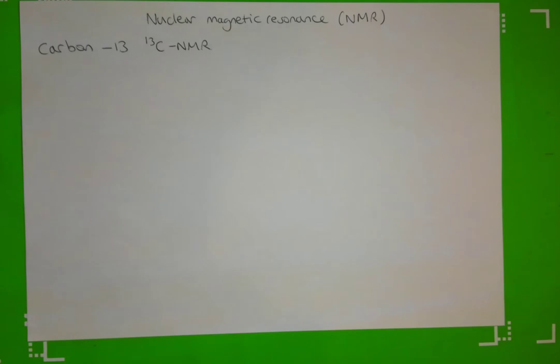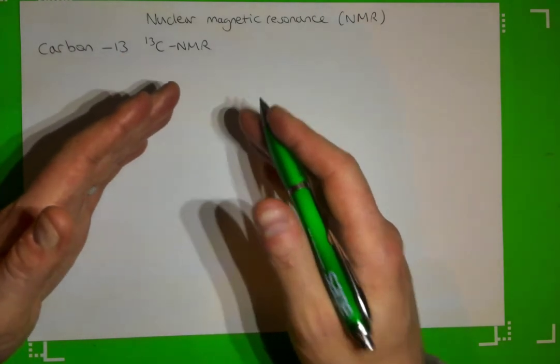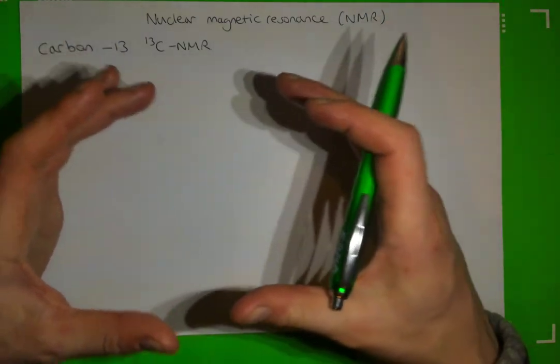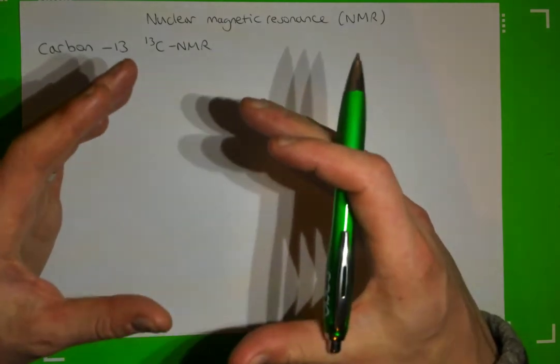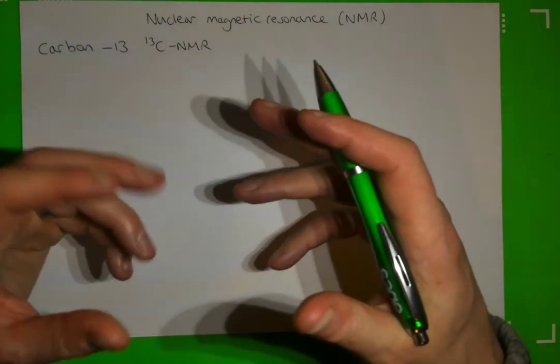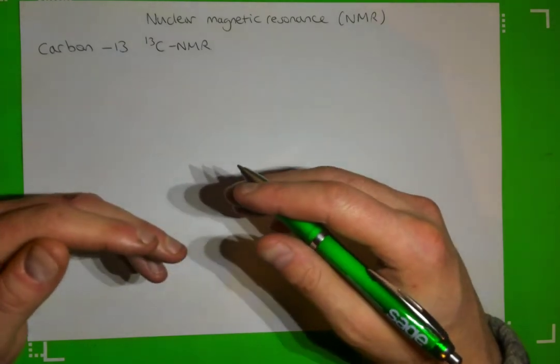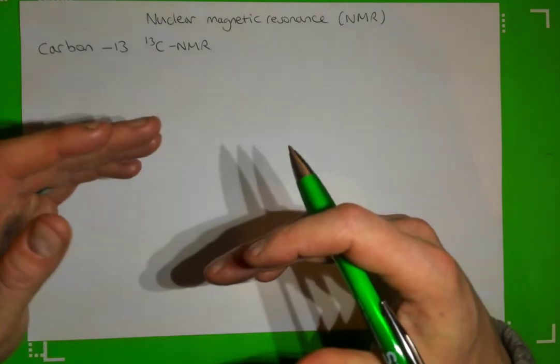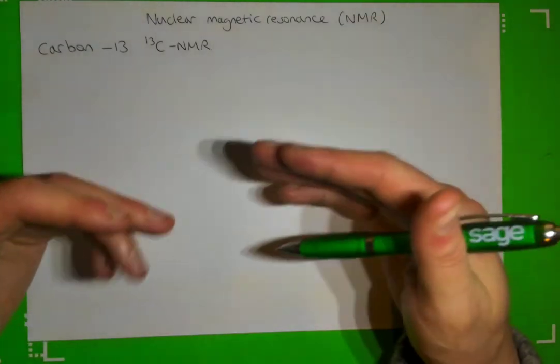But essentially, it's where we take a sample or molecule and we apply a magnetic field to it, and it's surrounded by a source of radio waves with a radio receiver, and this generates an energy change in the nuclei of the atoms, and it's that energy change in the nuclei of the atoms which determines the structure of the molecule, because depending on the environment of the atoms within the molecule, their frequency changes by a certain amount. We'll call that the chemical shift.